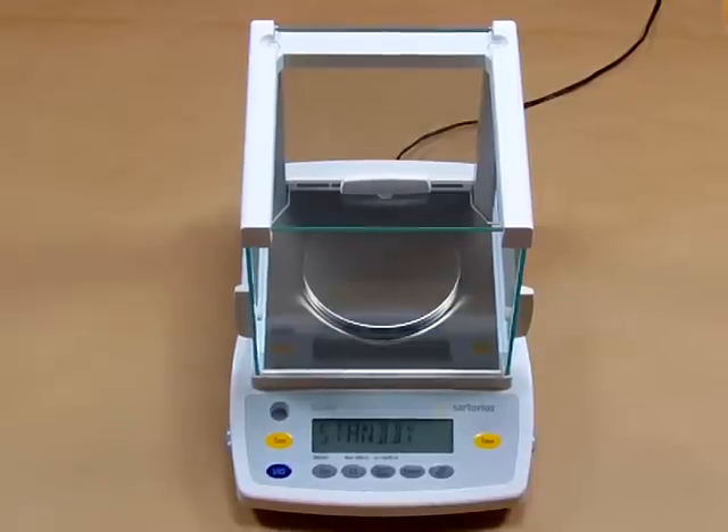Welcome to Precision Weighing Balances. Today we'd like to introduce you to the Sartorius GK3102.